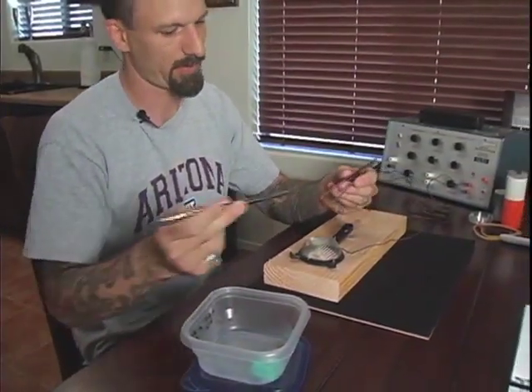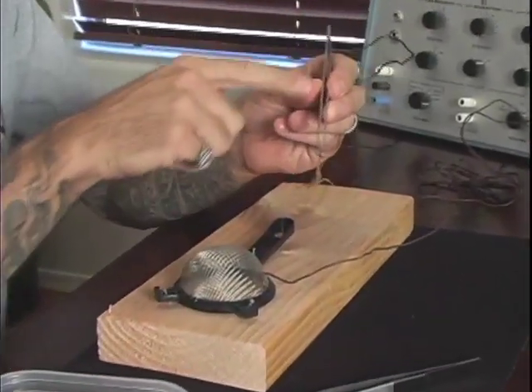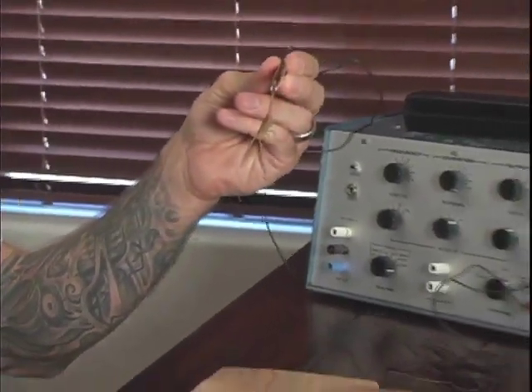In order to collect scorpion venom for my study, I need the scorpion to express its venom. To do this, I administer a low electrical stimulation. The electricity doesn't hurt the scorpion, but does make it express its venom.